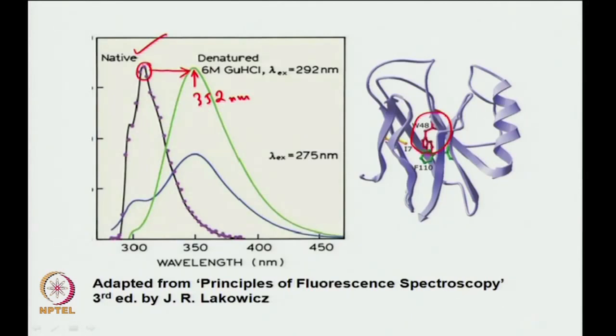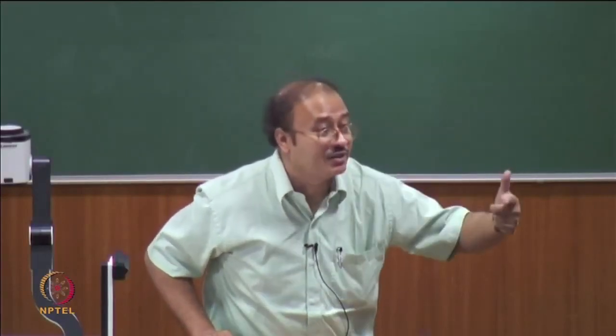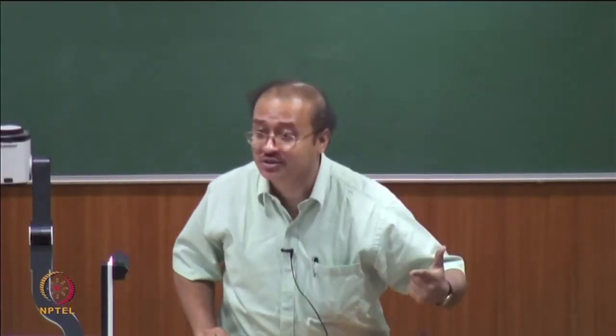So this is exactly what people do. And that is why you have to know fluorescence before you can do that, because you have to know at what point I will have to observe. And you always select the emission maxima, because these are the places where the changes are happening the most.